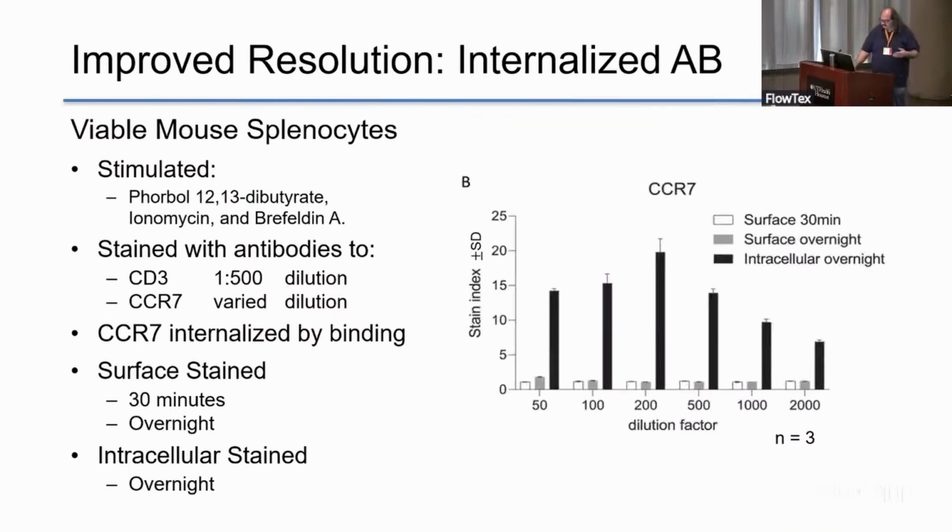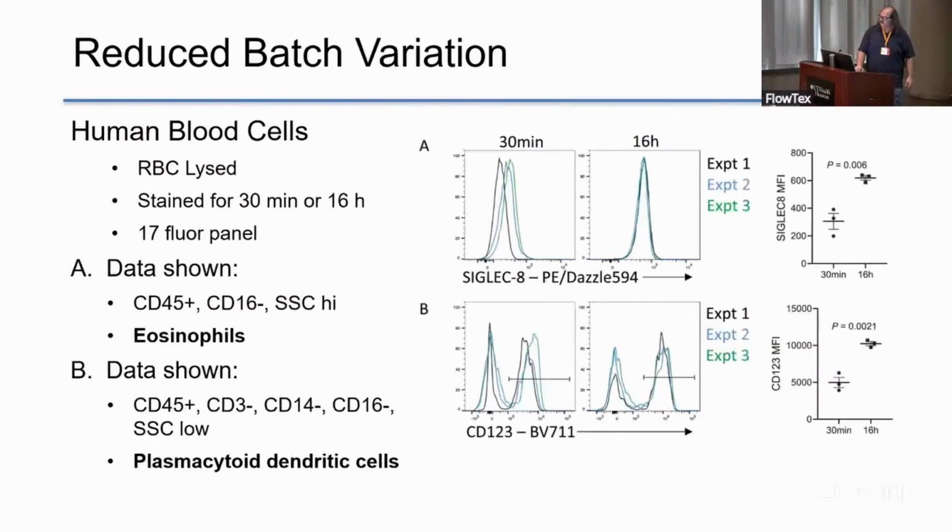So once again, I just make sure we show the stats. We clearly see that we can find a good titration level for our CCR7. So I don't want to spend too much more time on this. The paper's out. You can watch the video.